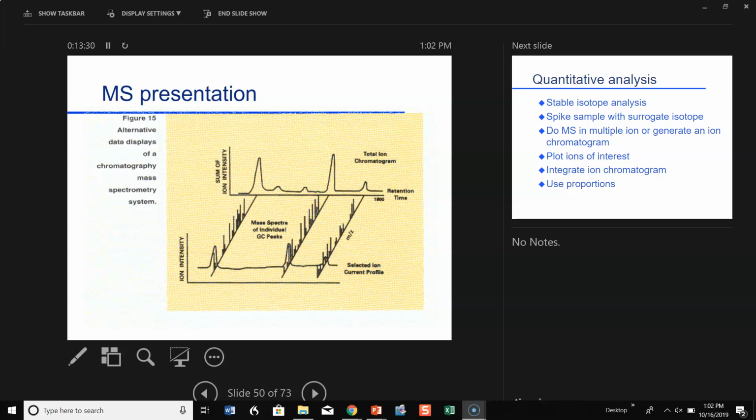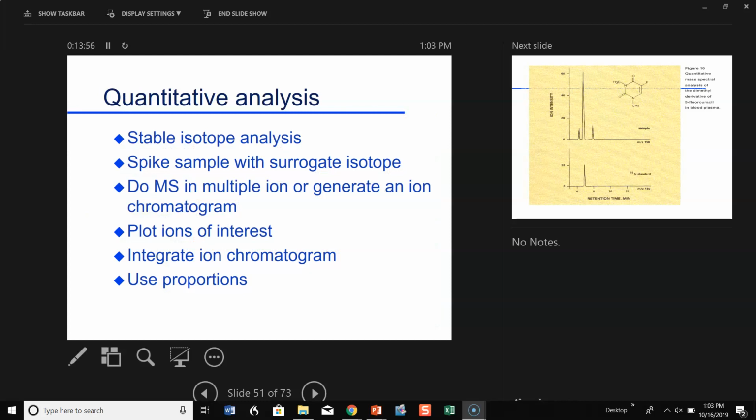Mass spectrometry also has another advantage for us in that we get kind of a chromatogram and we get individual mass spectra as we go along. And like I say, we can select things in each of these spectra to look for, to monitor. So we can keep on monitoring the composition of every peak as we go along. We're coming to an example for applications in a little bit.